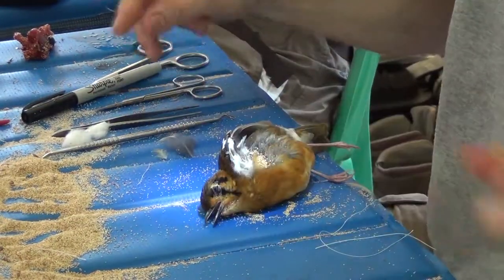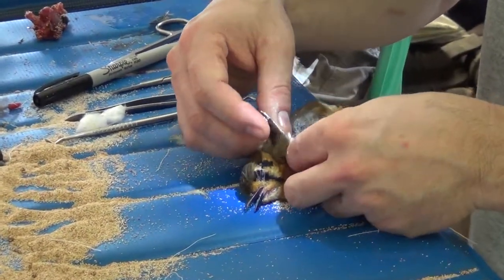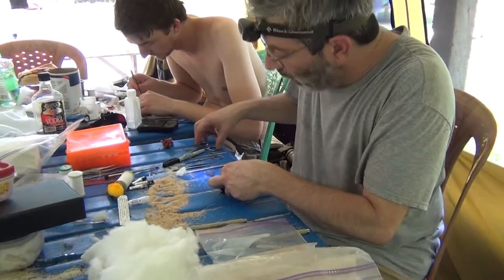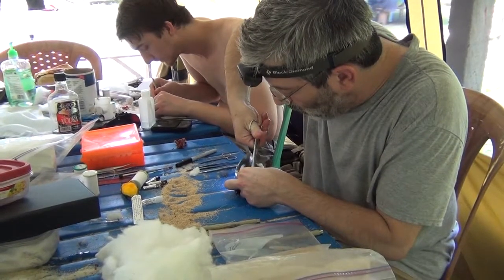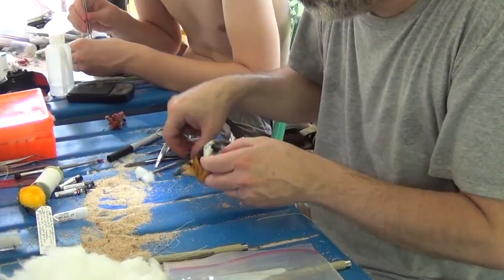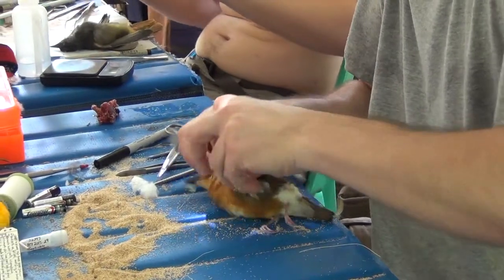From my original incision, what I'm doing is working towards cutting the wings, which will allow me to remove the body entirely. Here goes the first wing.